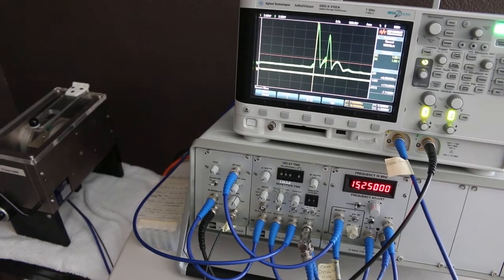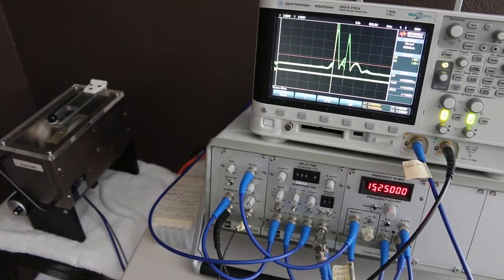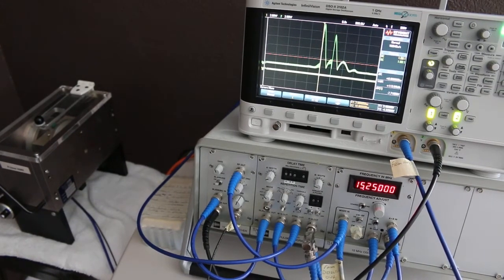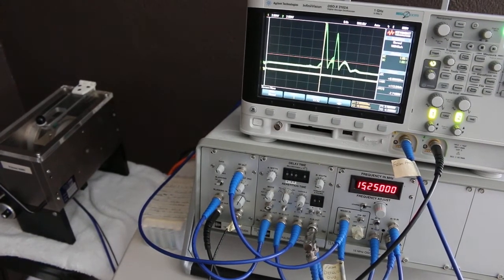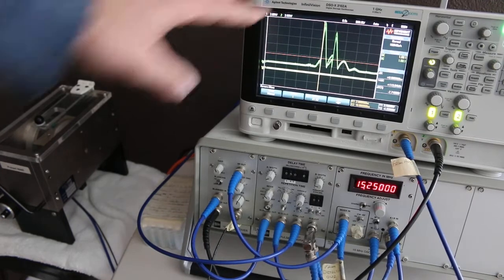Okay, hi students. So what you see in front of you here is the pulsed NMR apparatus. It consists of three parts. The first one is the oscilloscope, of course, which you're all used to.